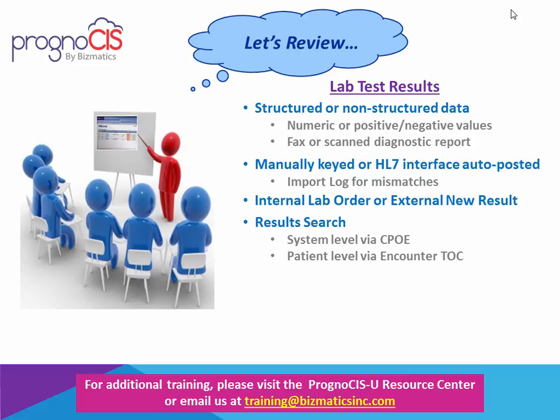You can search for result status, both at a system level under the CPOE module or at a patient level through the Encounter table of content. Lab status must be at a minimum approved. By default, it should be in an ordered status in order for results to be applied, and that is determined by local preference and how you configure the system property.